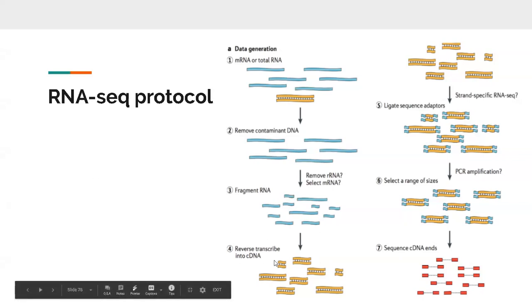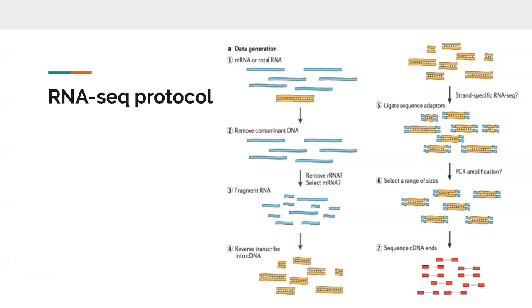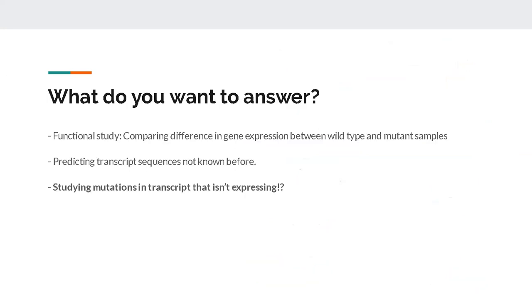Okay, because we are short on time, I'm going to reveal the answer. RNA is unstable as compared to cDNA, the DNA, right? So during the post-processing, it might get degraded to a much larger extent. That's the reason why we are converting it into a DNA before proceeding. Now, when you make the DNA, finally you put the adapters, as we have already seen in the video. Then we amplify it, and then we select for the sizes, and finally we sequence these ends, and that is what you get in the form of a file.